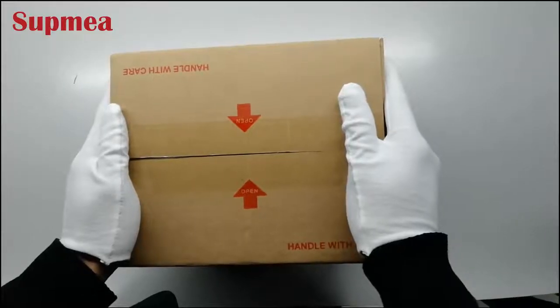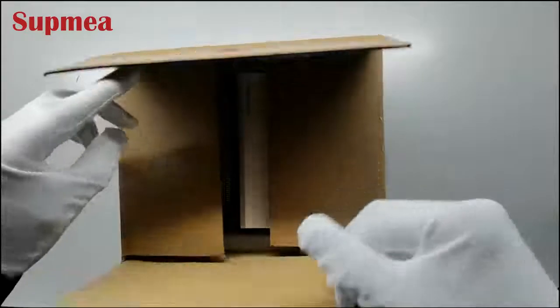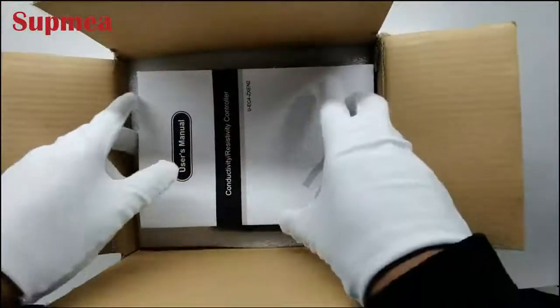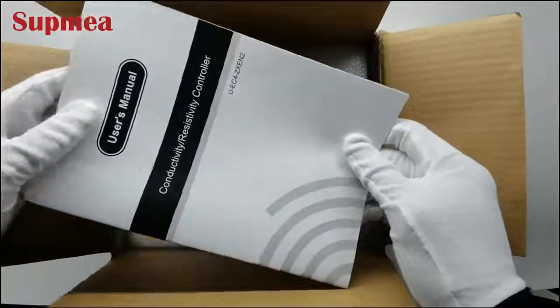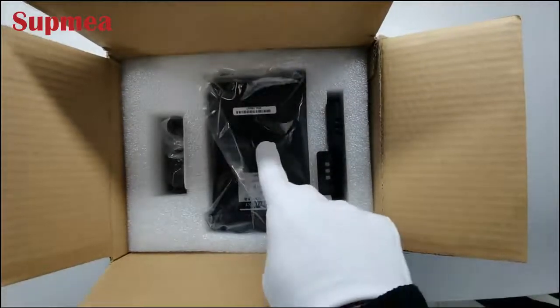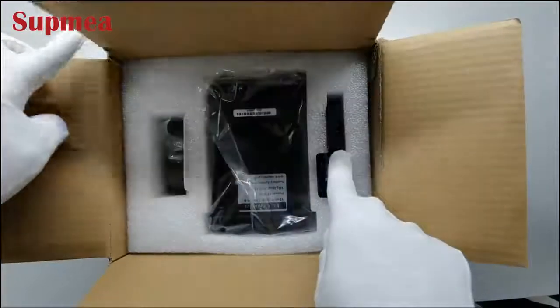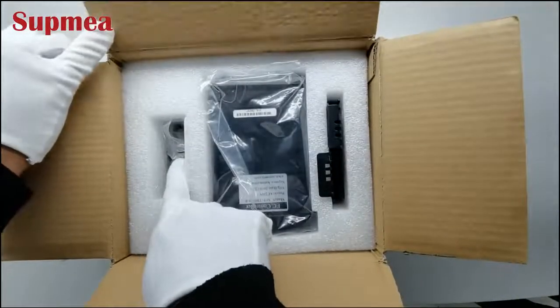Now, I will show you what's inside the package. First, we have the conductivity controller user manual, the controller, the bracket, the terminals, and the cable brands.